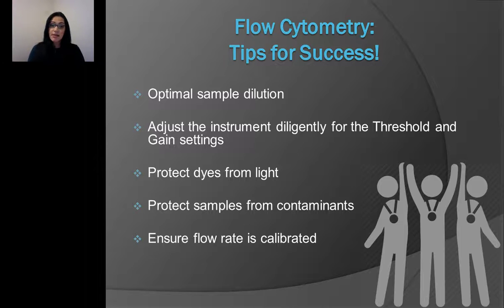Another thing is that these fluorochromes are light sensitive, and it's very important that you protect those little vials that contain the dyes from the light. Me personally, I don't like to leave them out at room temperature too long, so try to prep your samples in a timely manner, stain them and incubate them, and then put your dyes away, and also protect your samples from light.